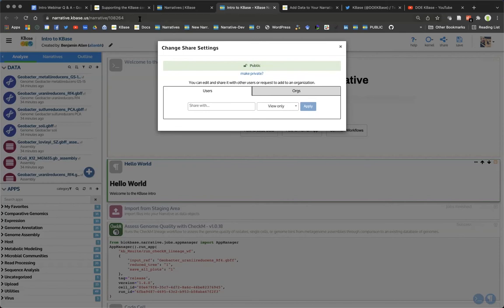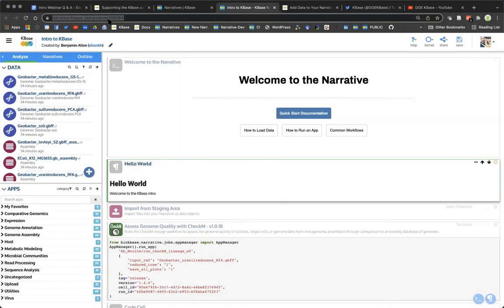Meaning that I can send this URL of this narrative to anybody, and you can come and look at it. So there's nothing particularly substantial in this narrative. I'm going to jump back in a second and just show some of the tutorials and other resources that we've got that are kind of premier public narratives.